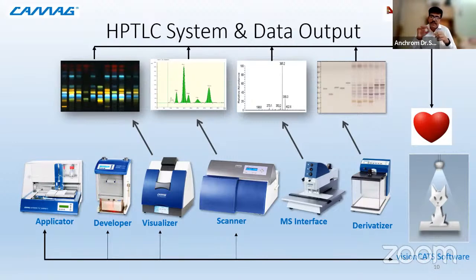For example, caffeine has a lambda max of 276. So when you scan it at 276, the background noise gets totally submerged, and only the molecule of my interest is highlighted over there. And that is how you increase the sensitivity of your analysis and do the quantification more accurately. Also, it has features to do spectrum comparison, that is, the spectra pattern obtained at different wavelengths of a particular spot, for example.